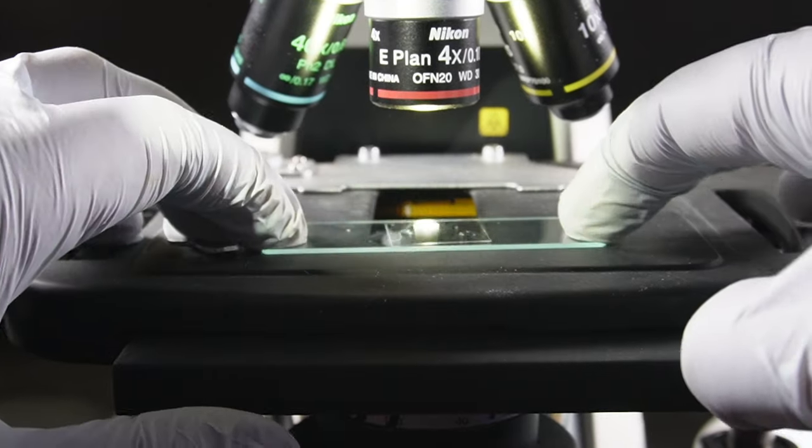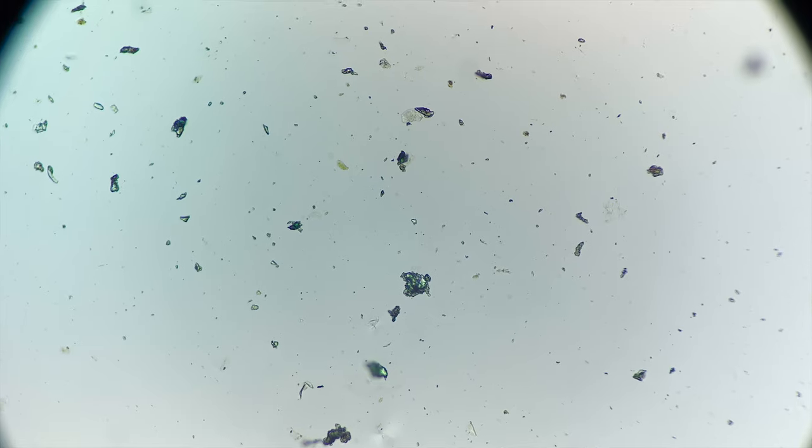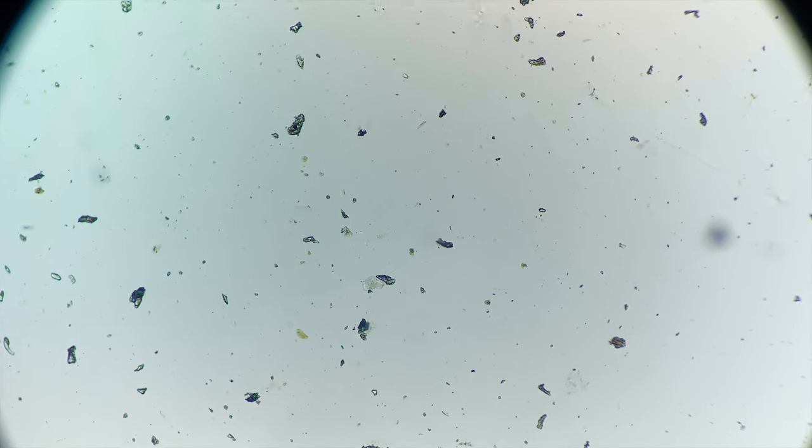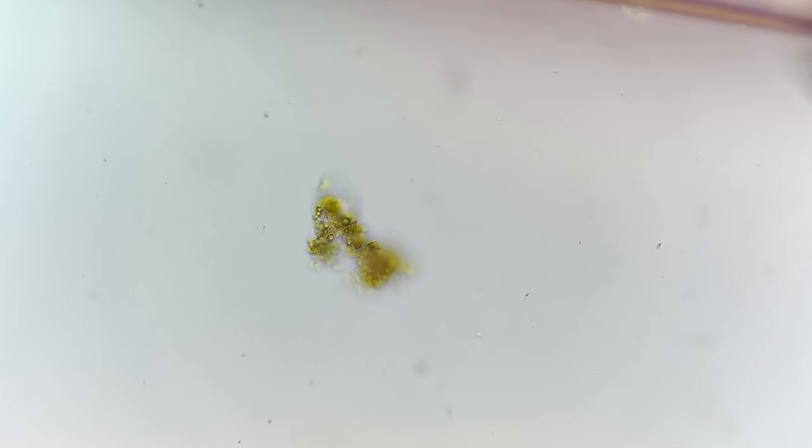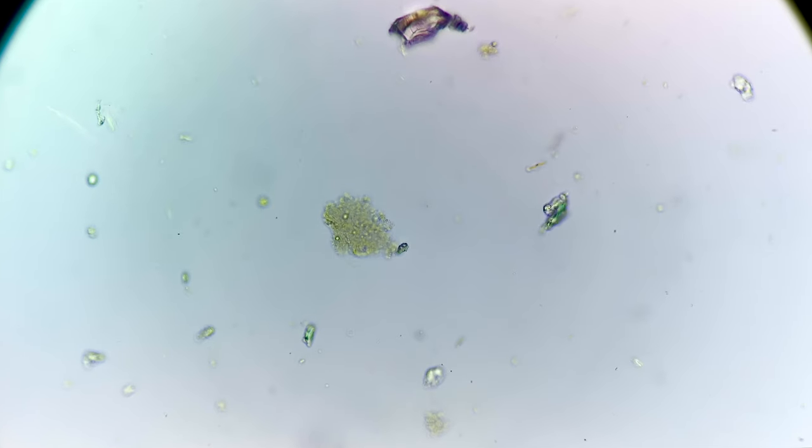Well this is it. Let's have a look at this under the microscope. These are my thoughts on the sample. The footage that you can see here might not look like a lot, but it's actually quite fascinating. It contains a lot of particle matter and I think this could be related to plants or bacteria.